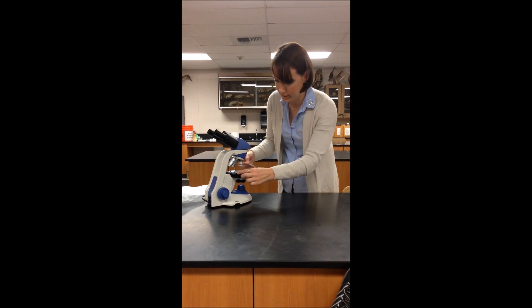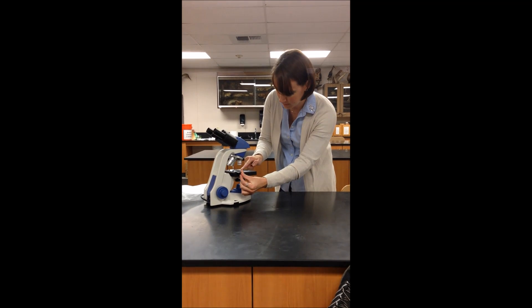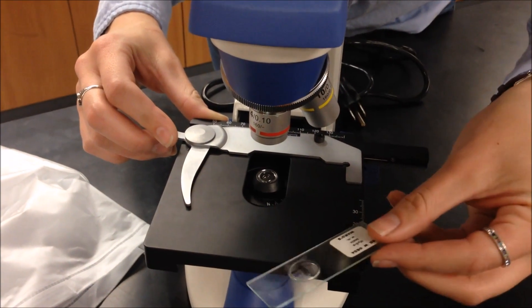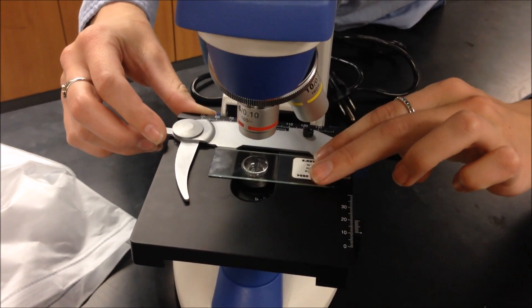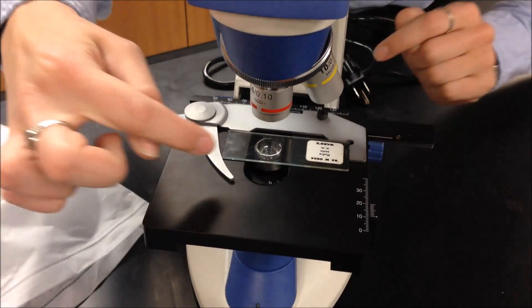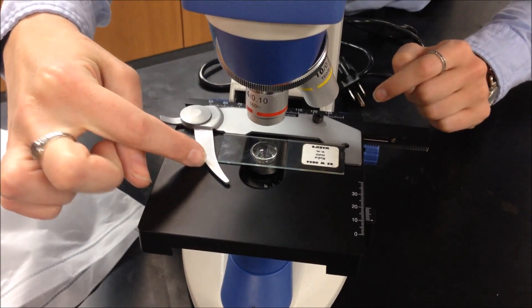Move this stage clip to the side to slide in your slide. When you place the slide in and lower the stage clip, the stage clip should move freely. The slide should not be jammed underneath the stage clip.